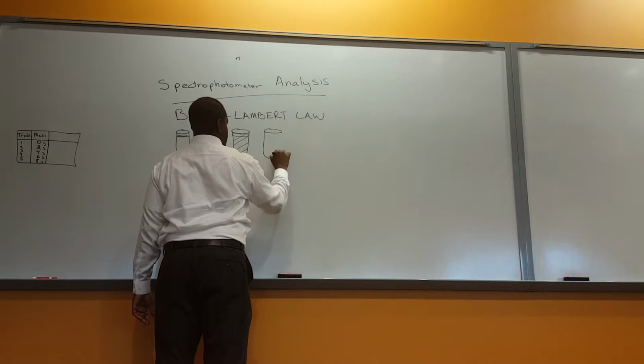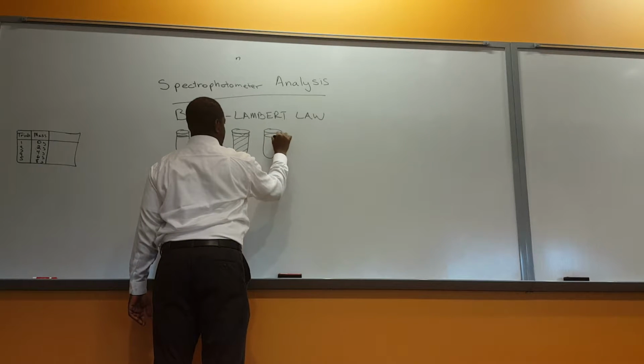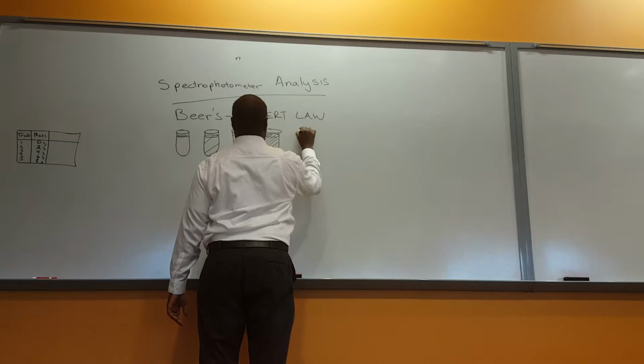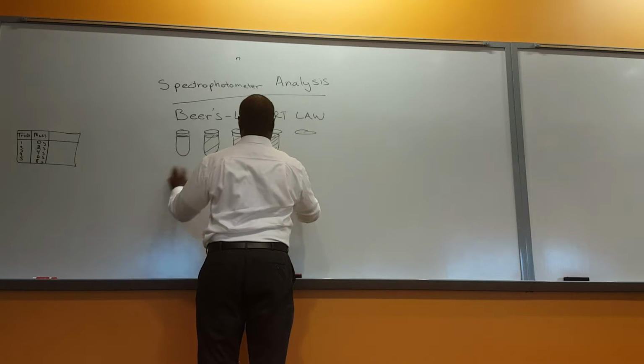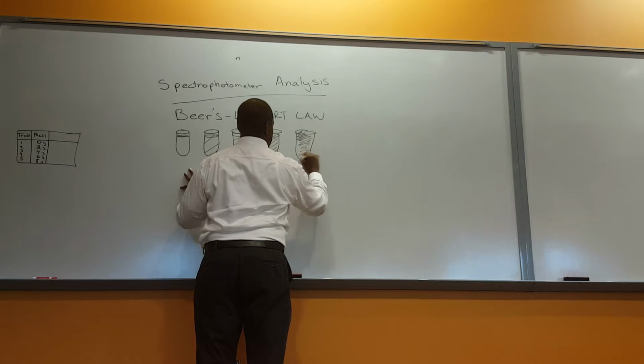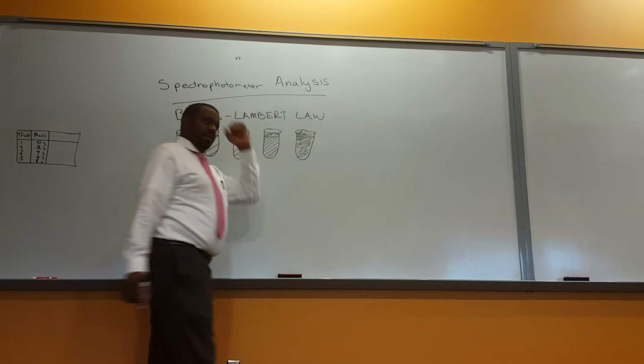So as you do your trials, the more concentrated the substance becomes, right? And then your last trial, 5, really dark, right?